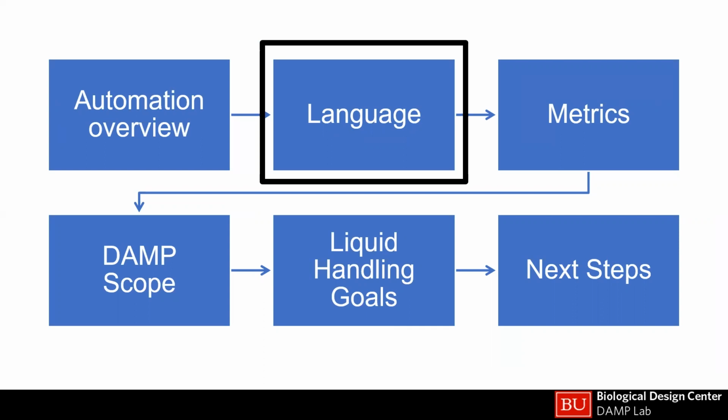Kristen talks to me and describes what the protocols should be, and then I have to talk to a machine or a robot. So there are many translation levels, and I think descriptive language is important in describing these protocols and also thinking about how to set up systems and processes.